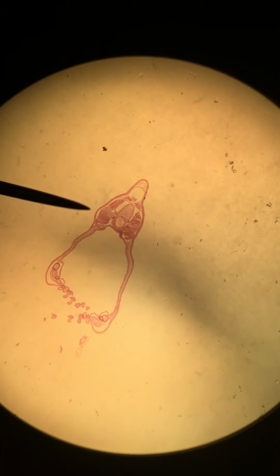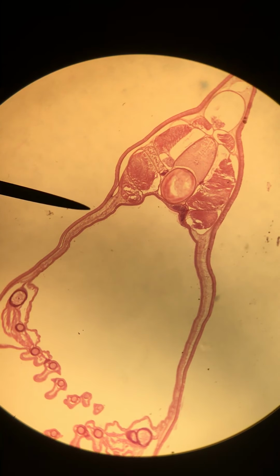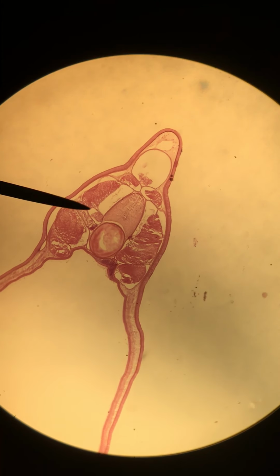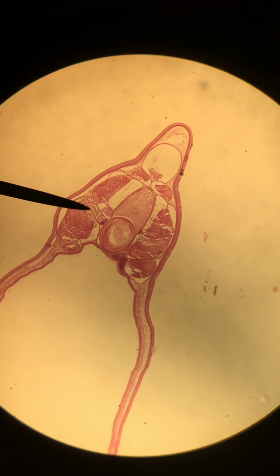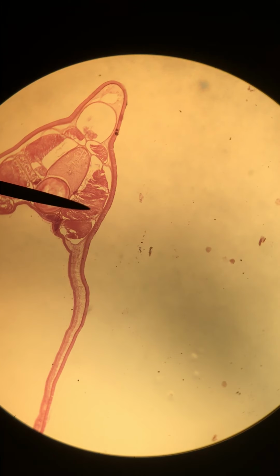So I'm going to zoom in a little bit more for us to see some more detail. We're right now on the lowest magnification. I'm going to increase our magnification just a smidge so we can take a look at the other details on this section. Okay, so this is towards the dorsal side, and you can see all of these little muscle layers. This is one, this is another, here's a third, and so forth. These are called myomeres, and they are separated into sections by myosepta. So the little line here, that is called a myoseptum. And they are present bilaterally.